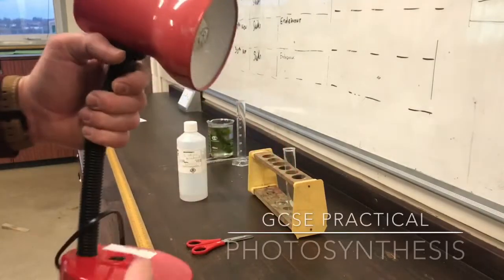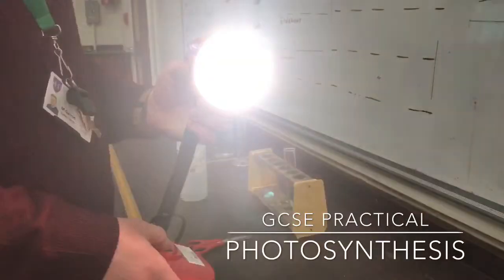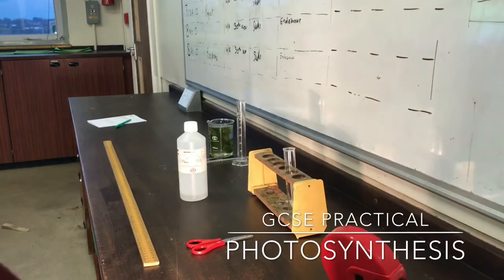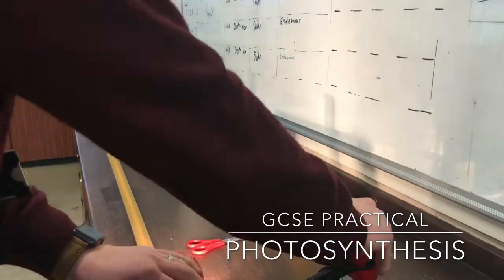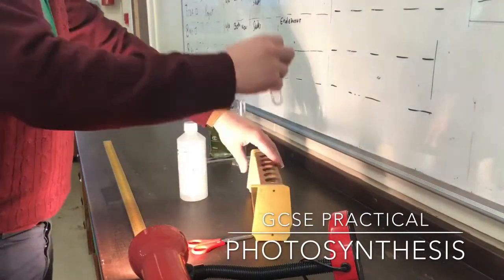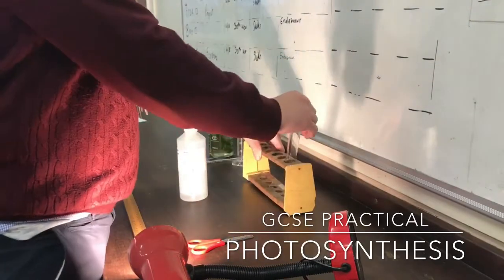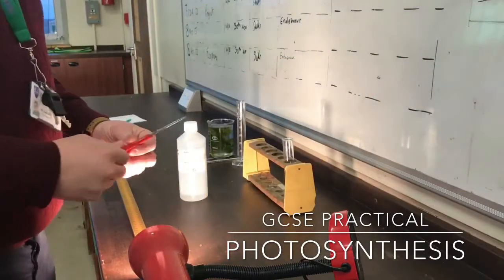Welcome to our GCSE photosynthesis required practical for AQA students. This is measuring the rate of photosynthesis in a plant. You'll notice I have a lamp ready with the equipment and the boiling tube and the test tube rack.